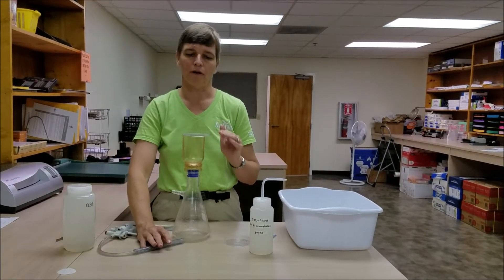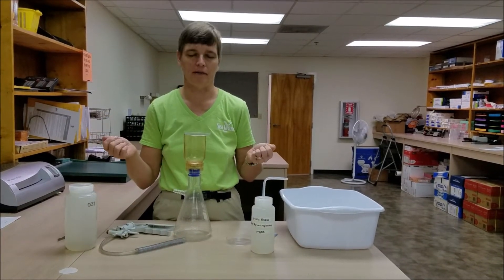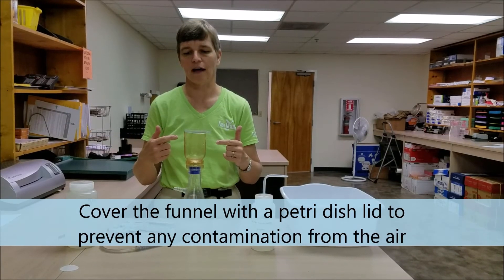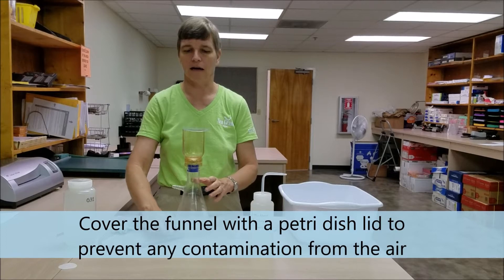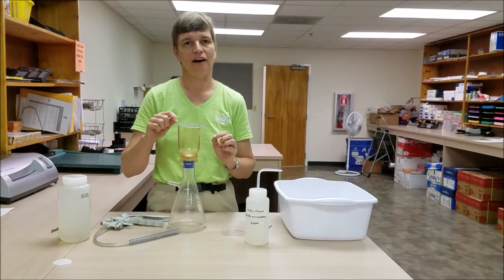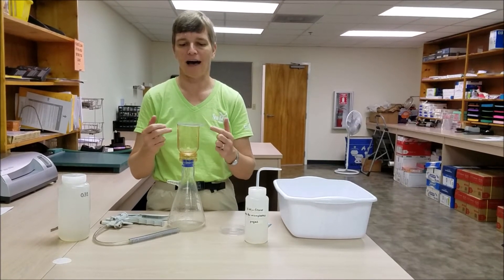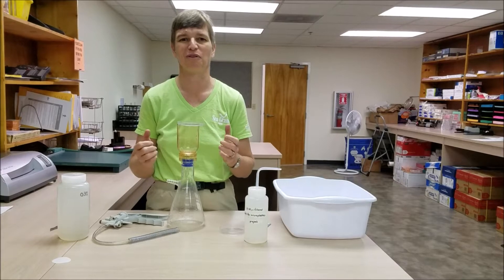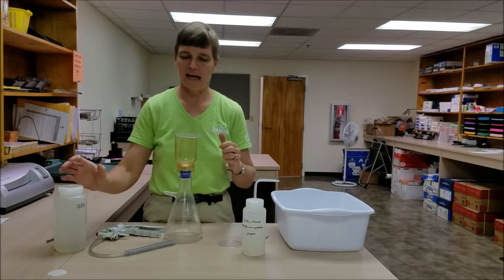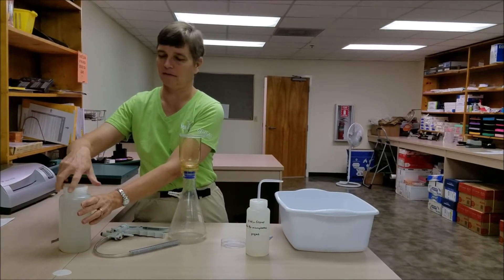At this point, we want to prevent any contamination of the filter by fibers that might be in the air. So we're going to use a petri dish lid to cover the flask as much as possible during the rest of this filtration process. You want to leave a slight air gap, otherwise the flask will become vacuum sealed to the filter holder and you won't be able to conduct your filtration — but do cover as much as possible with that petri dish lid.